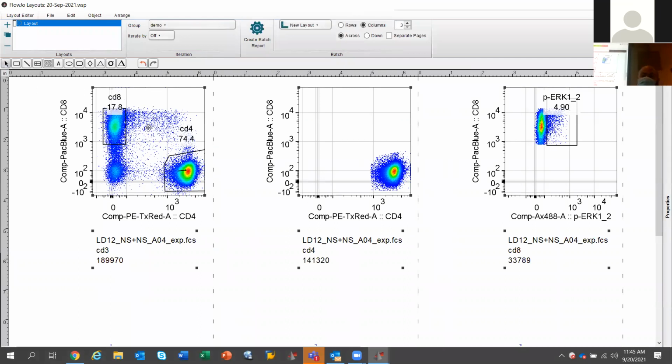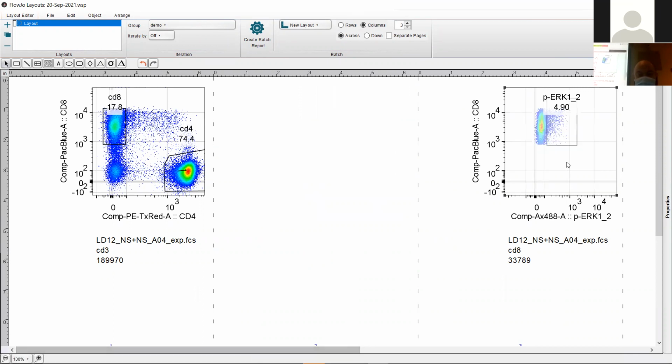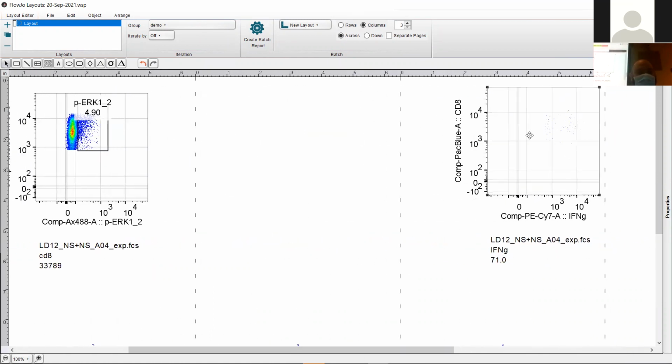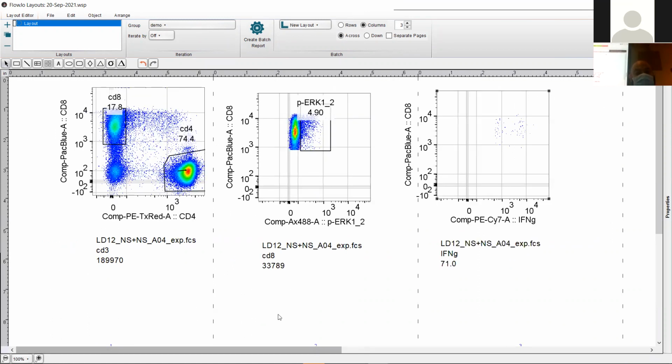All right, so I dragged those in there. I'm just going to delete 4 here. So you saw how I kind of messed up because I brought in an extra one that I did not necessarily want. So that gives us a good segue.